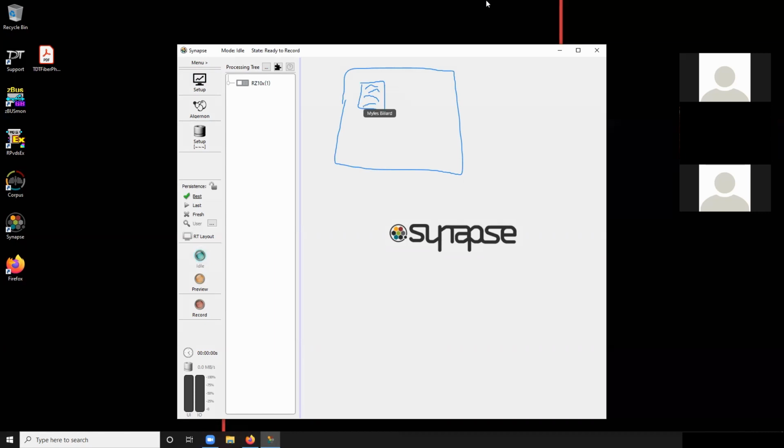But anyways, the way it's structured is that the tank inherits the experiment name, and then each recording inherits the subject name and then the date it was created. And this will make more sense once we see some recordings, but that's just a little context as to why the record button was gone before. If I make any of these blank, the record button goes away.